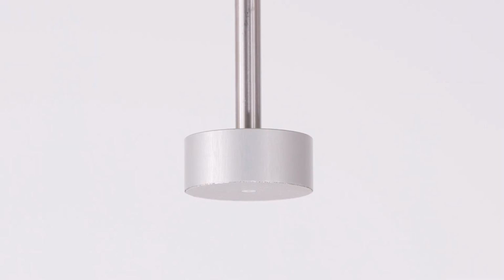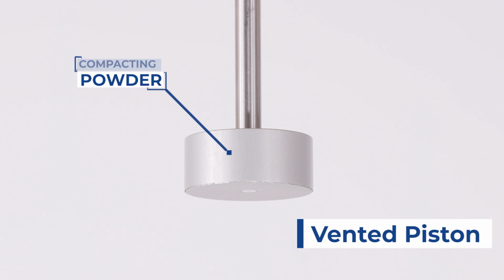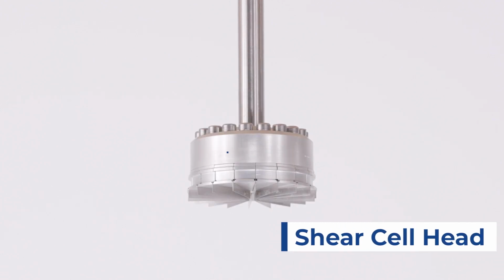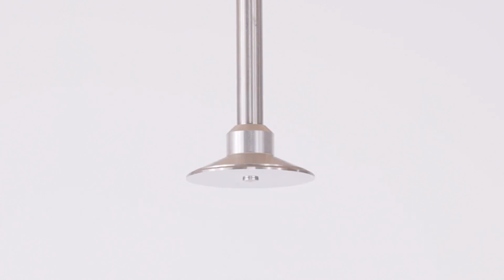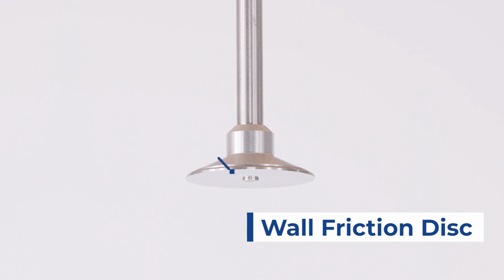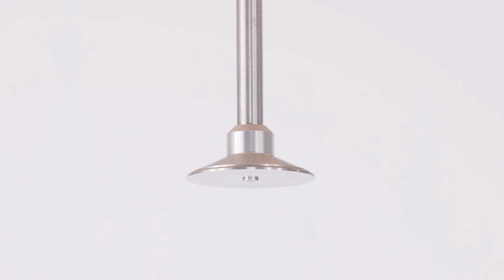Additionally, we have different spindle accessories such as the vented piston, which we will use for compacting the powder, the shear cell head, which we will use to perform shear testing and characterize particle-to-particle interactions under a high-stress environment, and the wall friction disc, which we will use to characterize the frictional interaction between the particles and the equipment wall.